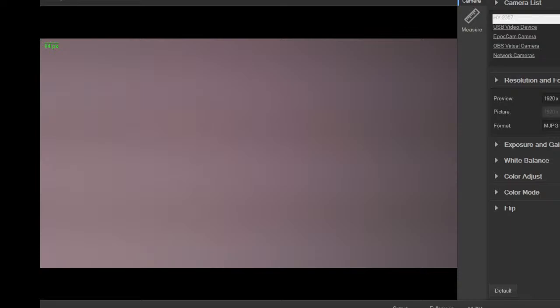But so these are again easily captured because I didn't have the right equipment to go trudging around. So this hopefully is a whole lot more interesting because there's a much more animated area, with lots more decaying material, some mud, lots more foot traffic I think in this area. And so it should have something cool in it. But again, I don't pre-check any of this stuff. This is all done live with fresh samples most of the time if I can get them. And so you're exploring this along with me. I have no idea what I'm going to see until I actually put it up there.